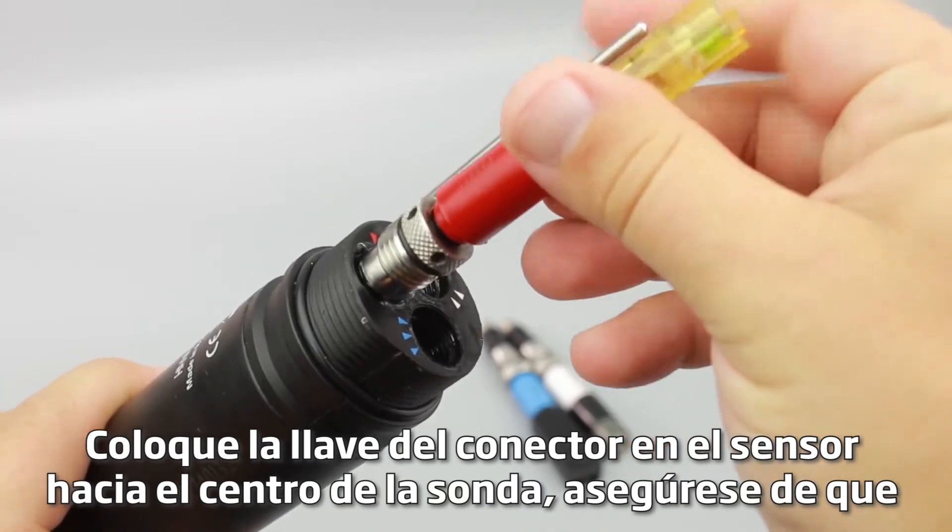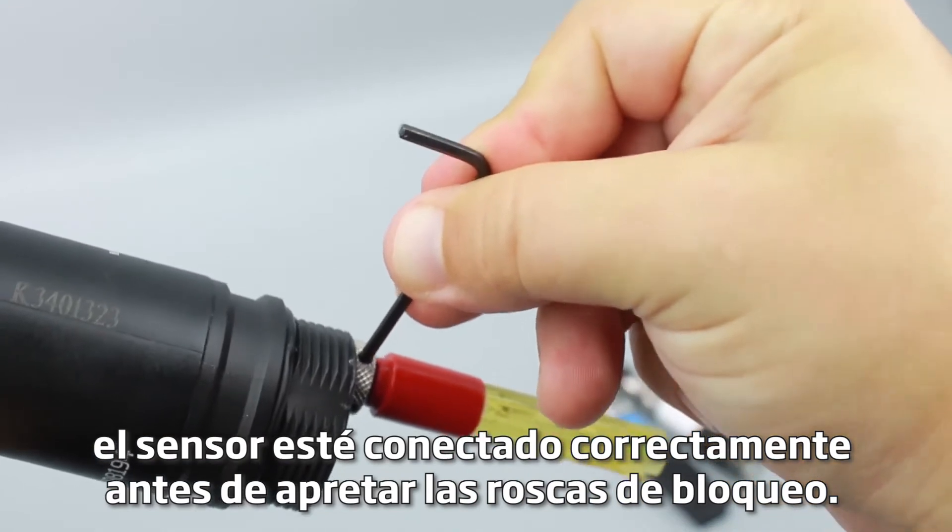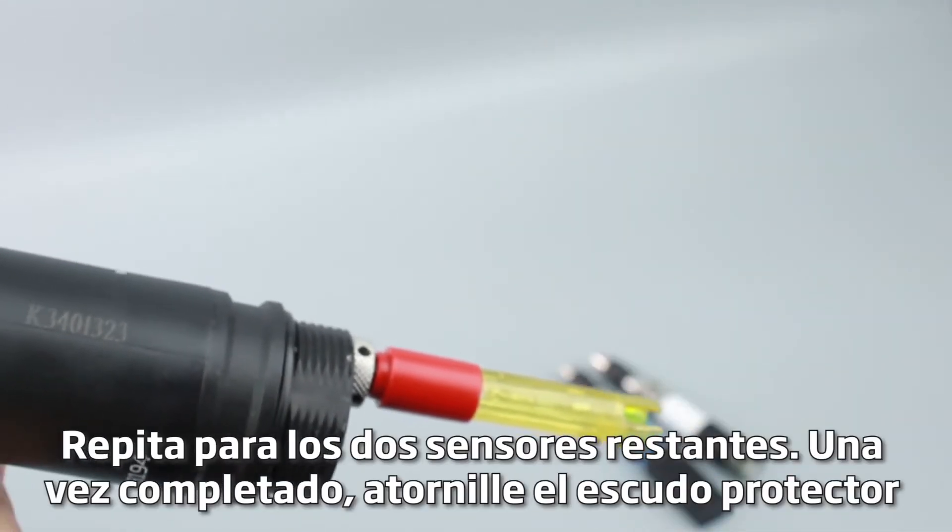Position the connector key on the sensor towards the center of the probe. Make sure the sensor is connected correctly before tightening the locking threads. Repeat for the remaining two sensors.